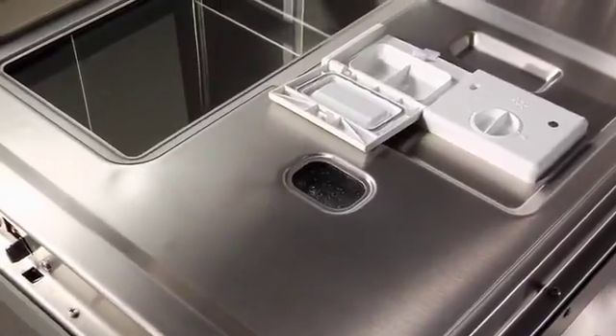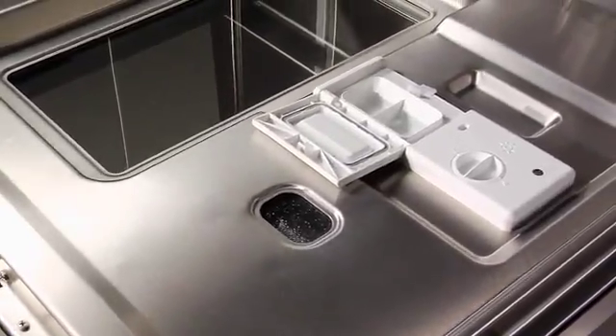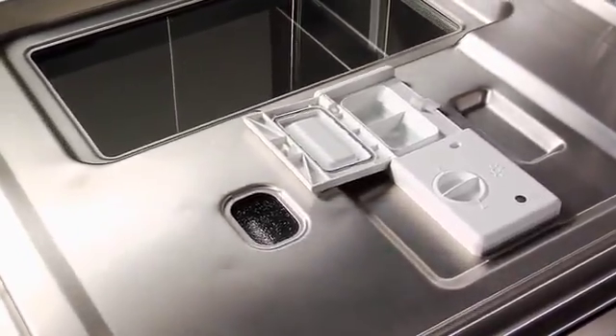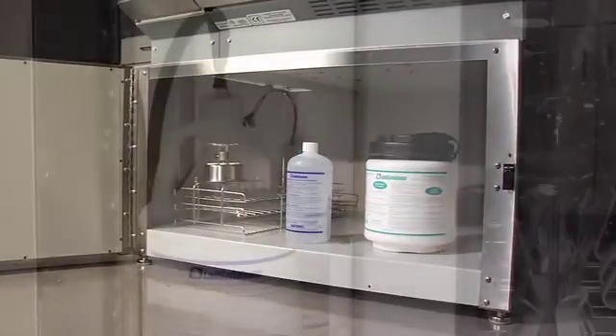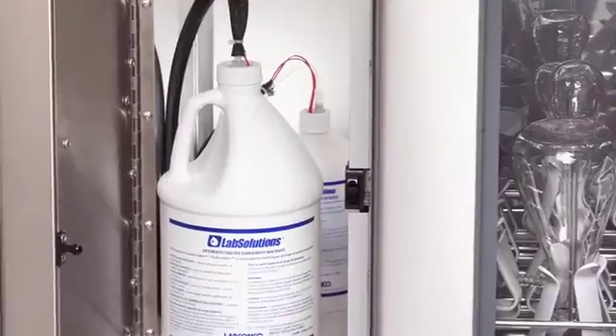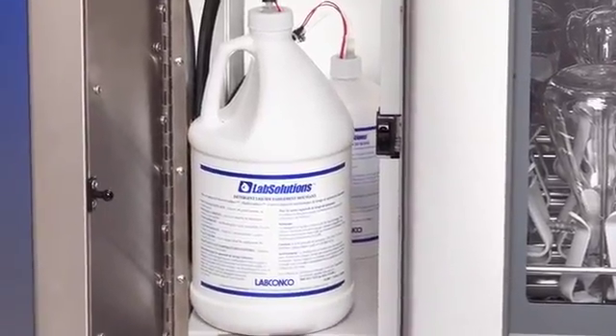A gasketed dispenser holds dry or liquid detergent. The Flask Scrubber Vantage also includes a liquid detergent dispenser with peristaltic pump and neutralizing acid rinse dispenser for hands-free dispensing.